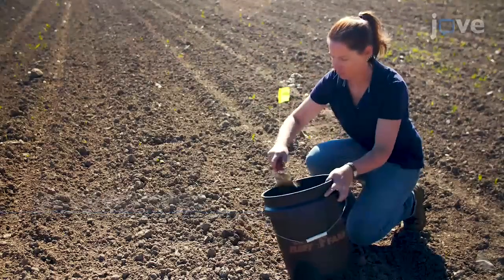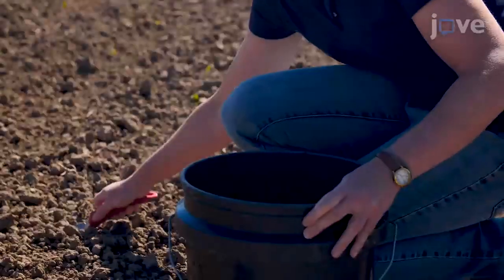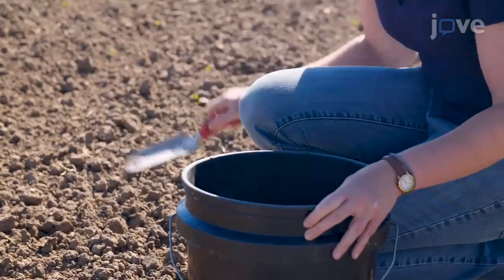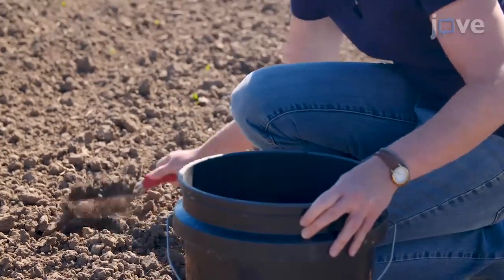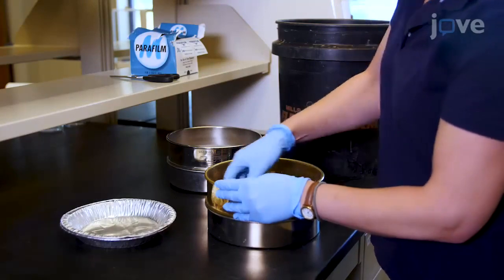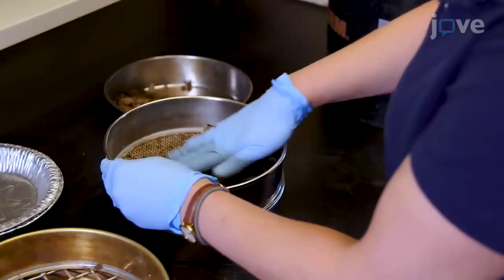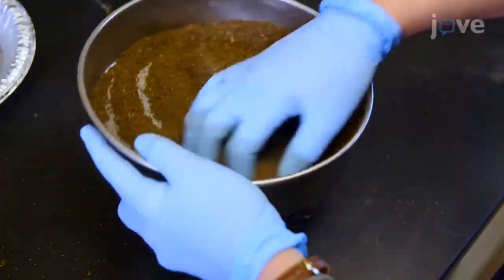To begin, collect approximately 4 liters of soil from desired sites. Limit collection areas to approximately 10 square meters to reduce the amount of spatial variability represented by the sample. Sieve samples through a coarse 20mm screen, followed by a 2mm screen. Thoroughly hand-mix the samples after sieving.